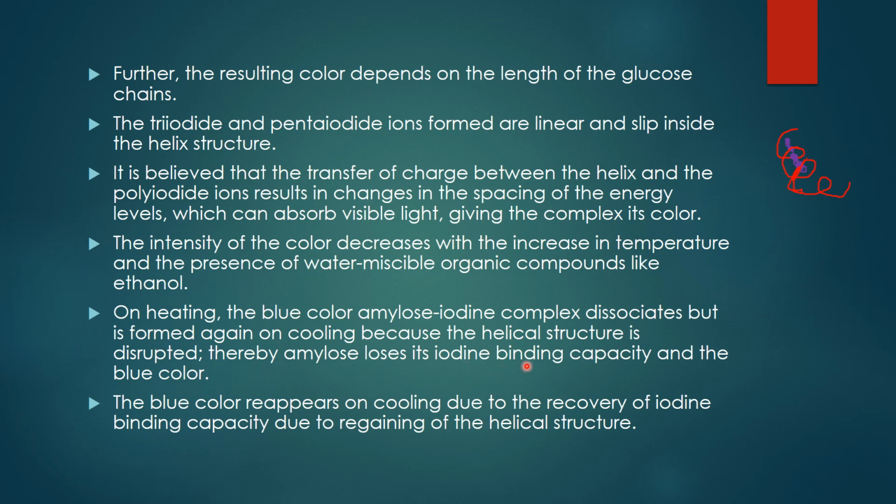And also the color will decrease. This is on heating, but on cooling the color will form again. Okay, the blue color reappears on cooling due to the recovery of iodine binding capacity, due to regaining of the helical structure.